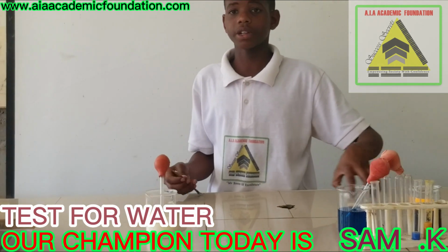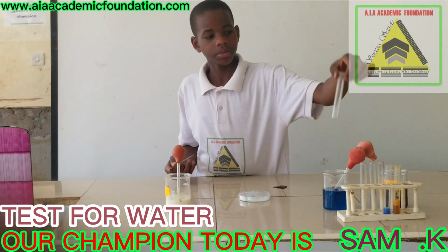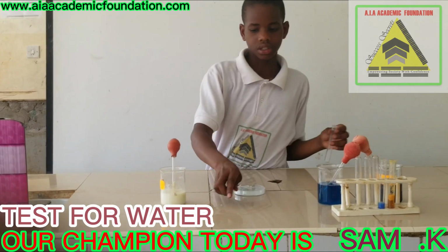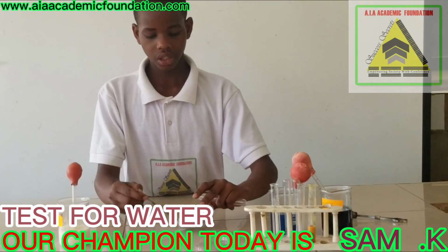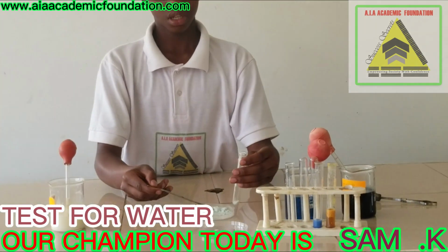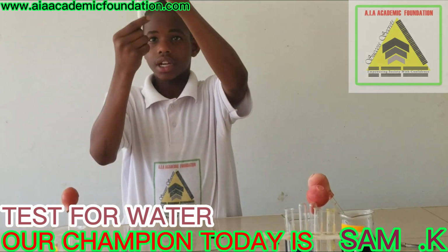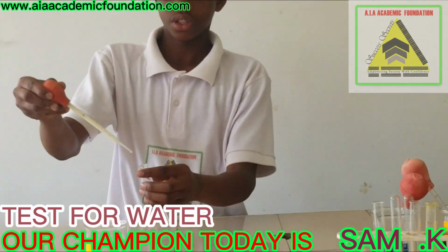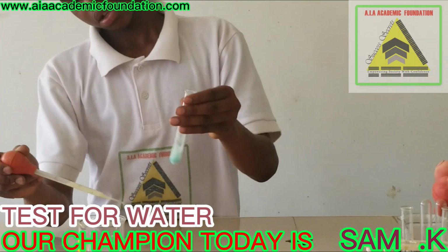To carry out this experiment, we shall use a spatula to get some anhydrous copper sulfate into a dry test tube. So here let me add anhydrous copper sulfate to this dry test tube you see here. If there is water in milk, then this white anhydrous copper sulfate will turn from white to blue.